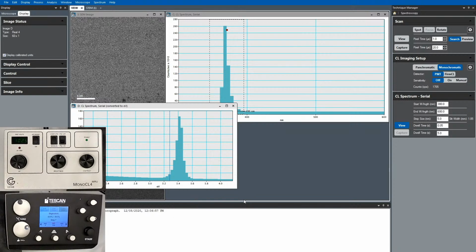And I believe I also can just save this in text format, user data. Let's see, I'm going to make a folder for SAM.